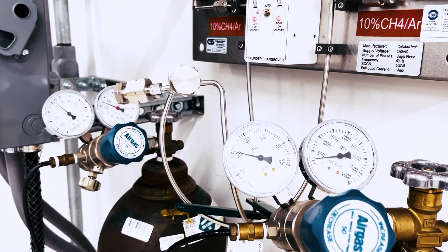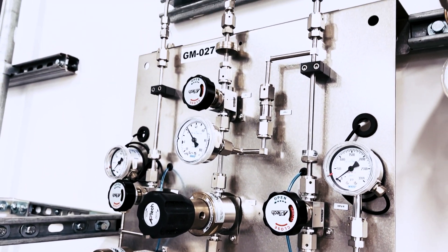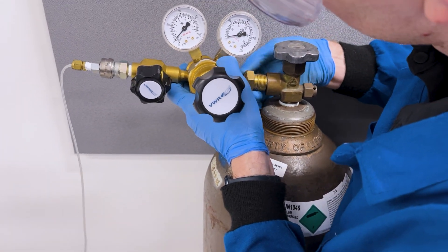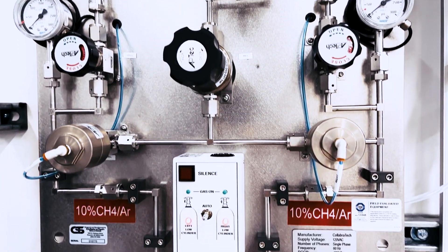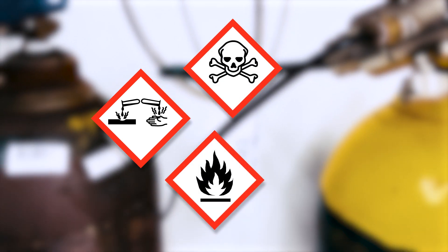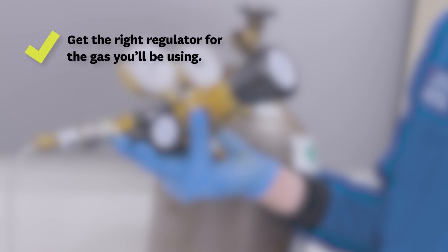Regulators always need to be compatible with the type of gas and the maximum cylinder pressure, as well as providing an appropriate output pressure range for the intended use. The Compressed Gas Association, or CGA, has standardized the connectors used to attach the regulator to the cylinder. There are about 17 different fittings in use, designed to minimize the likelihood of using the wrong regulators with gases which have special hazards like being corrosive, toxic, flammable, or oxidizing. Many of these fittings are uncommon, and it is beyond the scope of this video to cover the details. When constructing new systems, you should always check with suppliers to ensure you get the right regulator for the gas you'll be using.